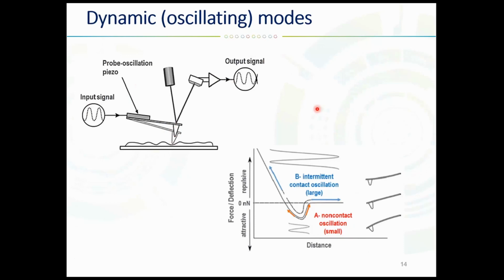So this oscillating signal is generated and applied to the cantilever mechanically, right? Here you can see the difference between the movements.